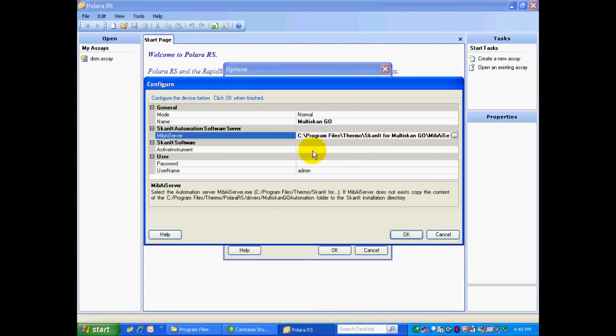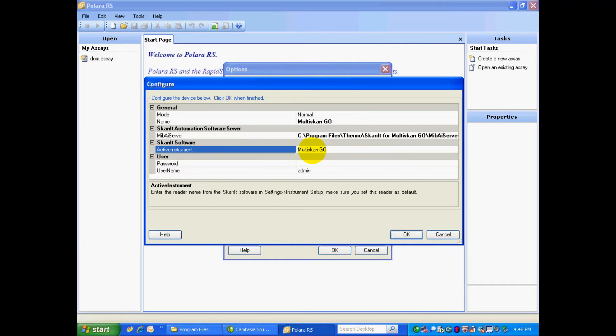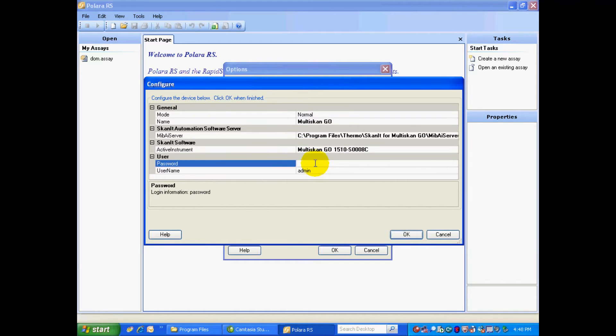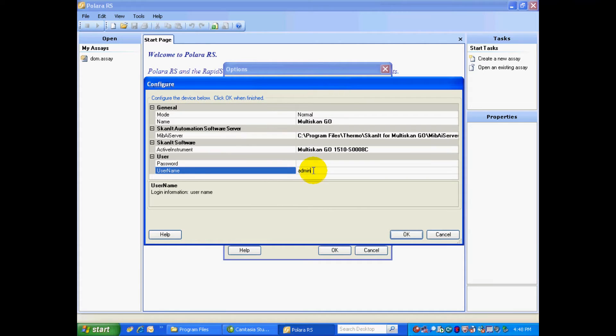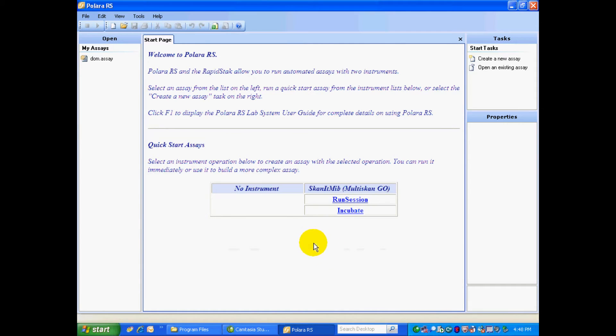But for now, we'll continue on. Next we have to give the active instrument, which is the default instrument in ScanIt. I know what my active instrument is, so I'm just going to type that in. If you don't know what your active instrument is, a little later on in this video I'll show you where to find that exact name in the ScanIt software. But for now, we'll continue on. I don't have a password in ScanIt, but in ScanIt my username is admin. So I'm all set here, and I select OK, and OK.